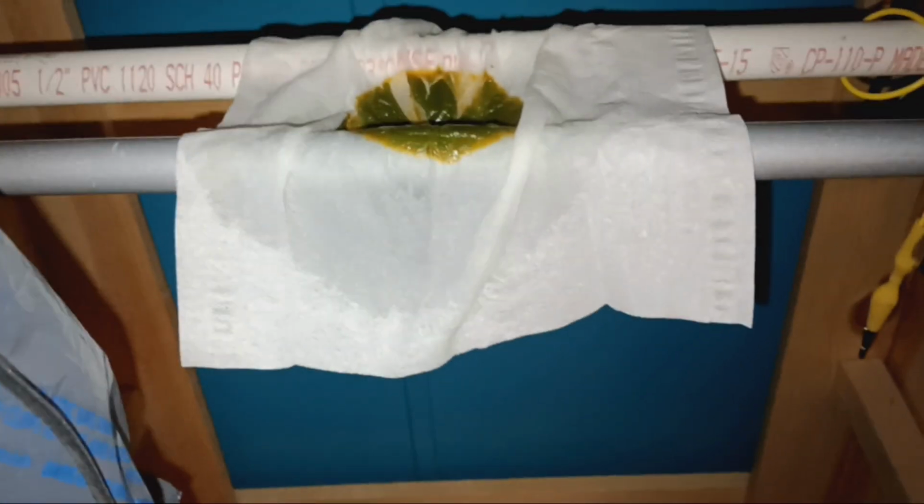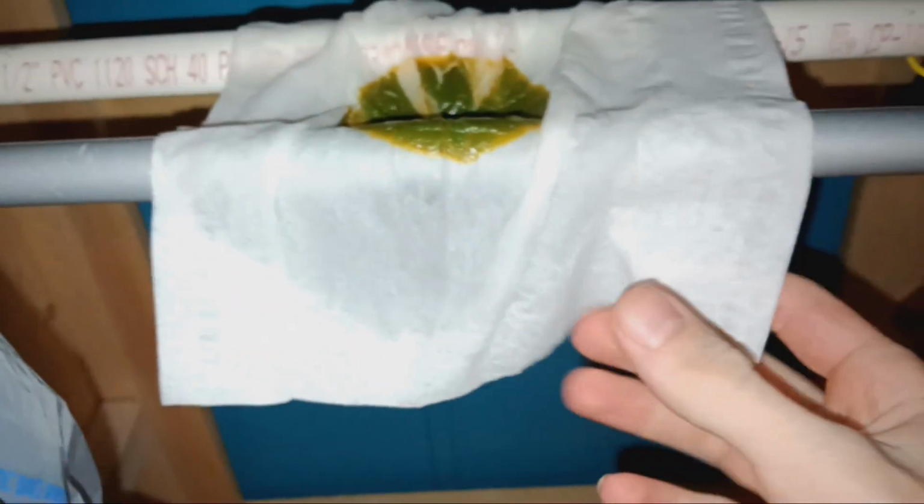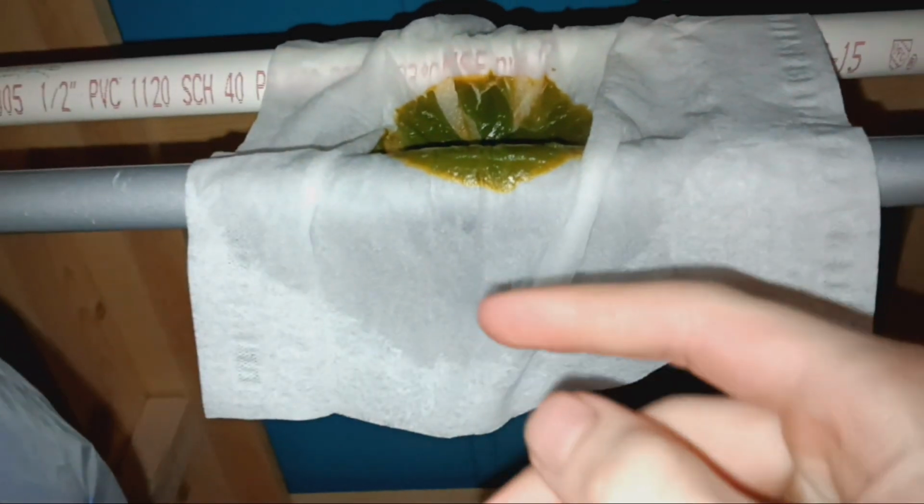The other thing is that we have to dry this. As you can see, it's turning orange, which, I'm not sure why this iron oxide is green. You can see there's still, oh my, it's very interesting. I don't know if you can see this, but there's crystals of something inside the paper towel. Well, this is not a paper towel, this is a tissue, but it works very well for filtering things.